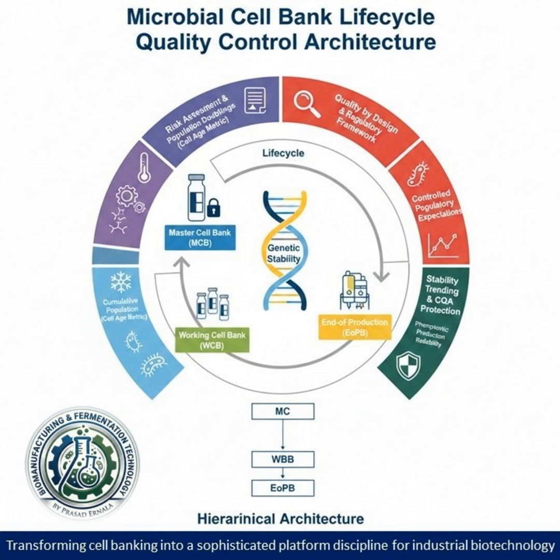And why is that quantitative age so much more important than just time in the freezer? Because biological function changes with doubling. It's an empirical fact. Productivity, stress tolerance, even the lag time when you thaw a culture, all of it varies depending on how many times that population has replicated. So by quantifying CPD, you replace guesswork with a hard number. A measurable, controllable variable. Exactly.